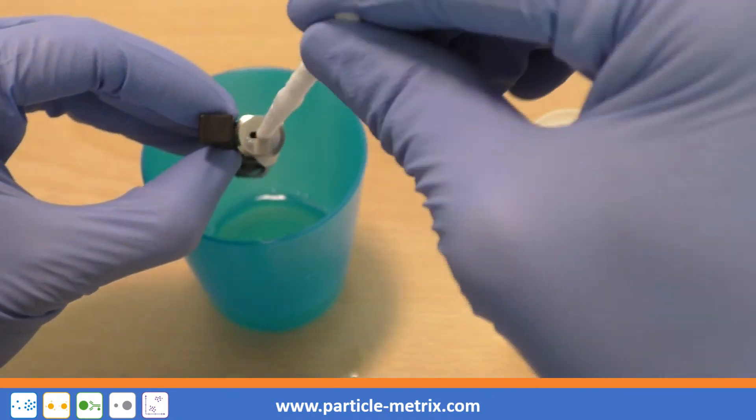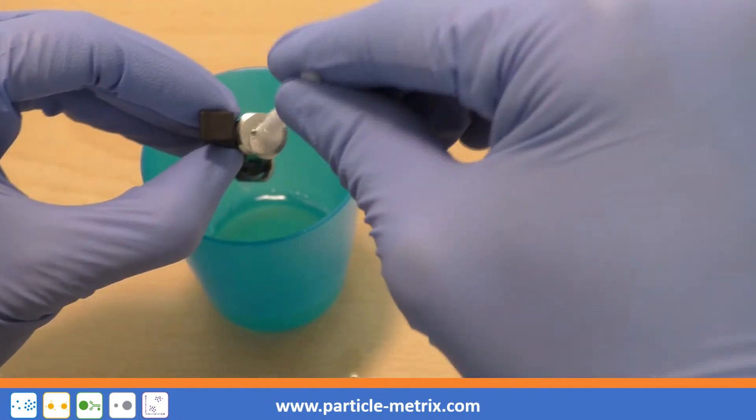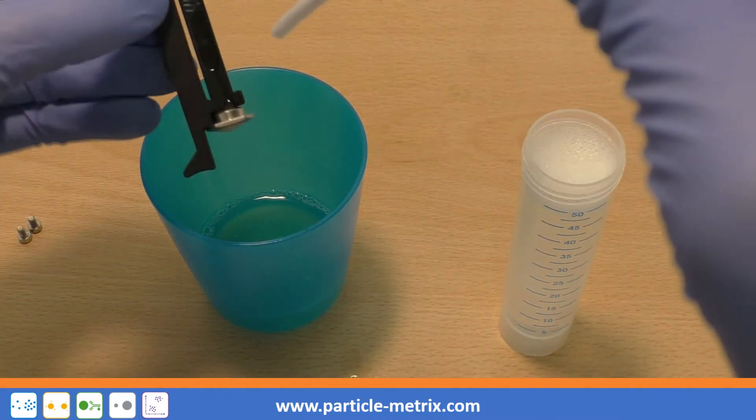It doesn't matter if excess cleaning solution runs along the outside of the cell. Repeat from the other side of the cell.